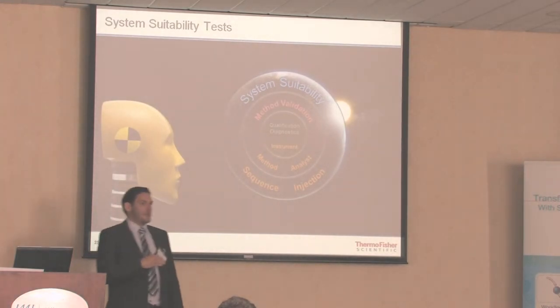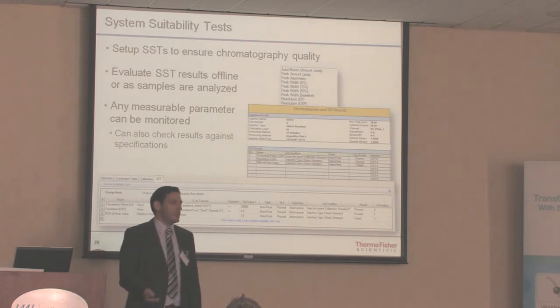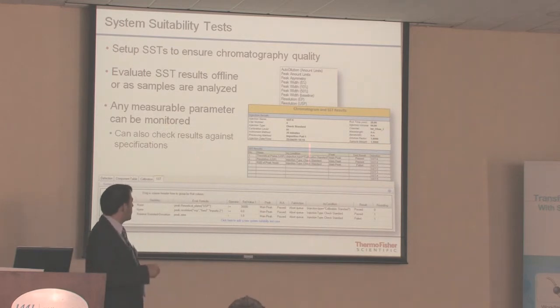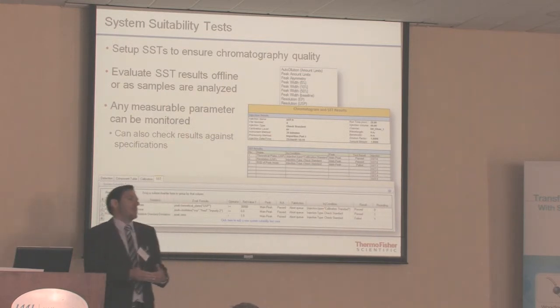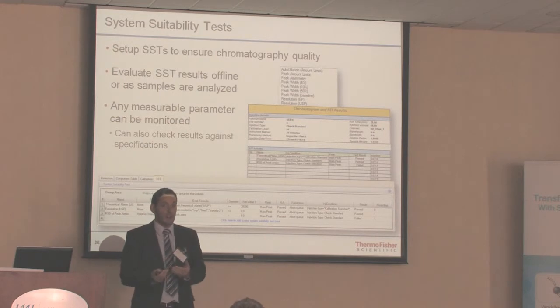I'm not going to talk much about system suitability tests, but it's important you know what they are. Most people hopefully do know what they are, but if you're not sure, a system suitability test is normally set up to ensure chromatography quality, no matter what you're doing. And basically, you're going to monitor these system suitability tests to see how everything's going. Chromeleon does have lots of features that I'm not going to talk about in the system suitability test, but what you have to keep in mind is, what happens when these system suitability tests stop or fail? What happens then? In most systems, it's either do you want to continue or do you want to stop? But it's normally something you have to do manually, or the very topmost which we do is just abort the whole run.